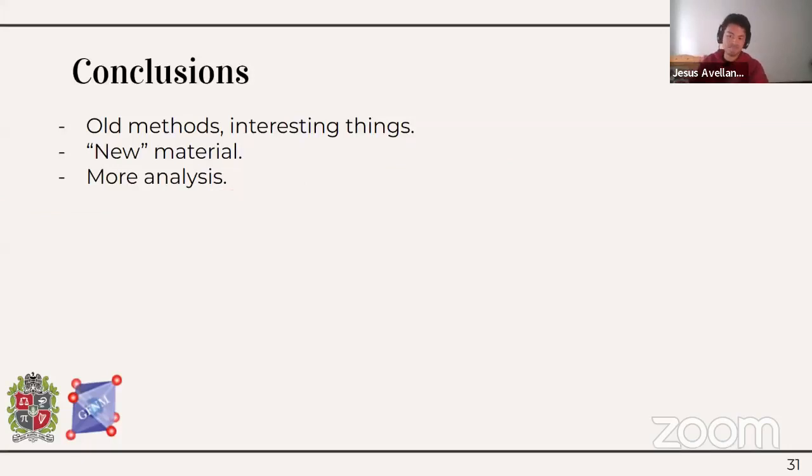So, in a really short conclusions part, because I think that all the things that we discussed in this little presentation are proof enough that we basically have an ongoing but interesting material. Well, first, it was possible to synthesize a material with quite relevant characteristics using a relatively old method, such as the solid-state reaction.